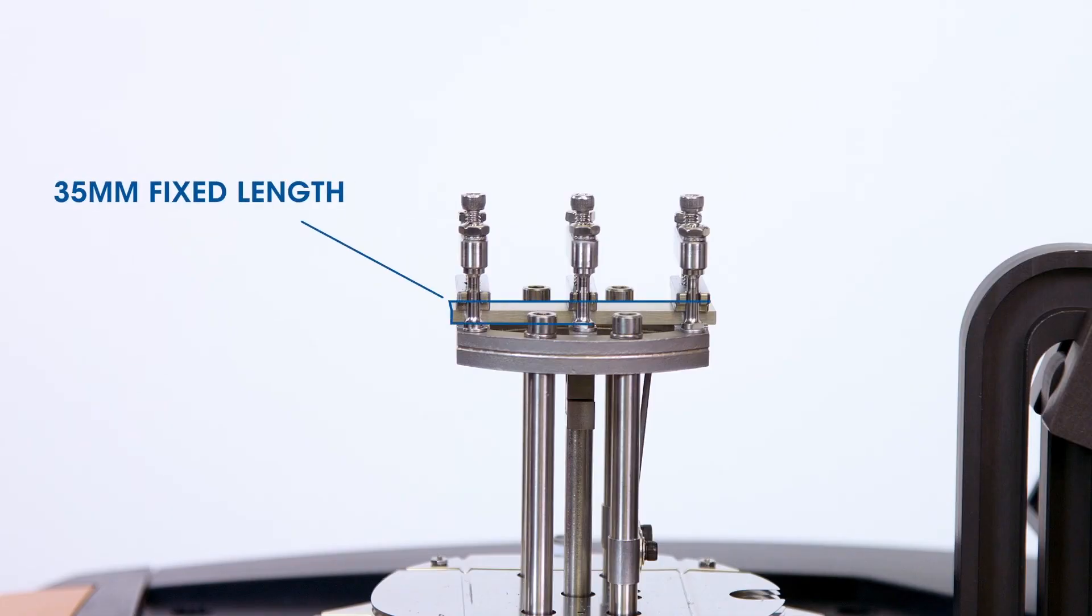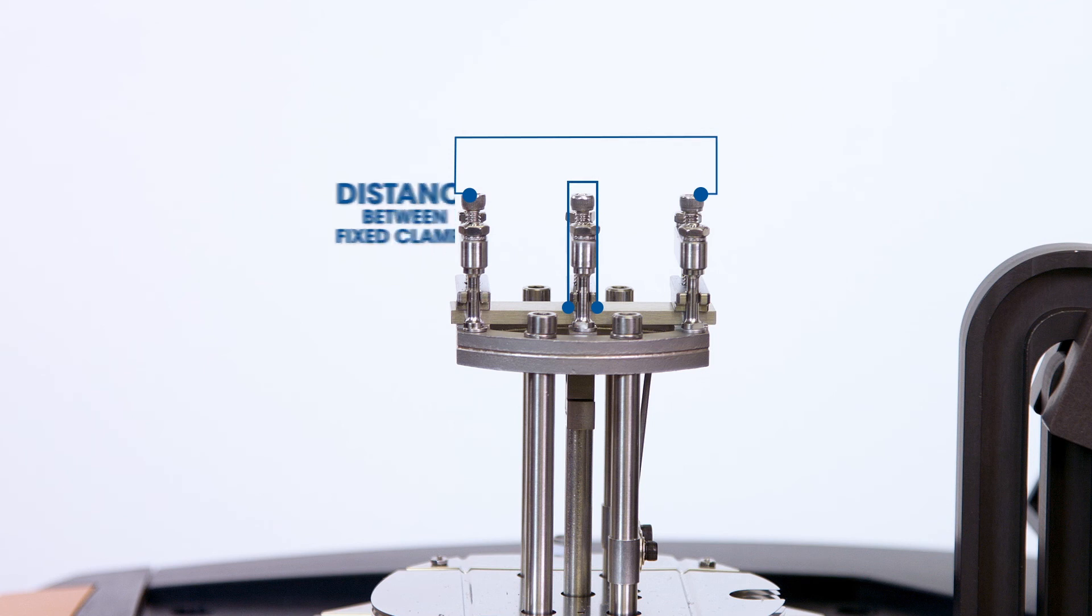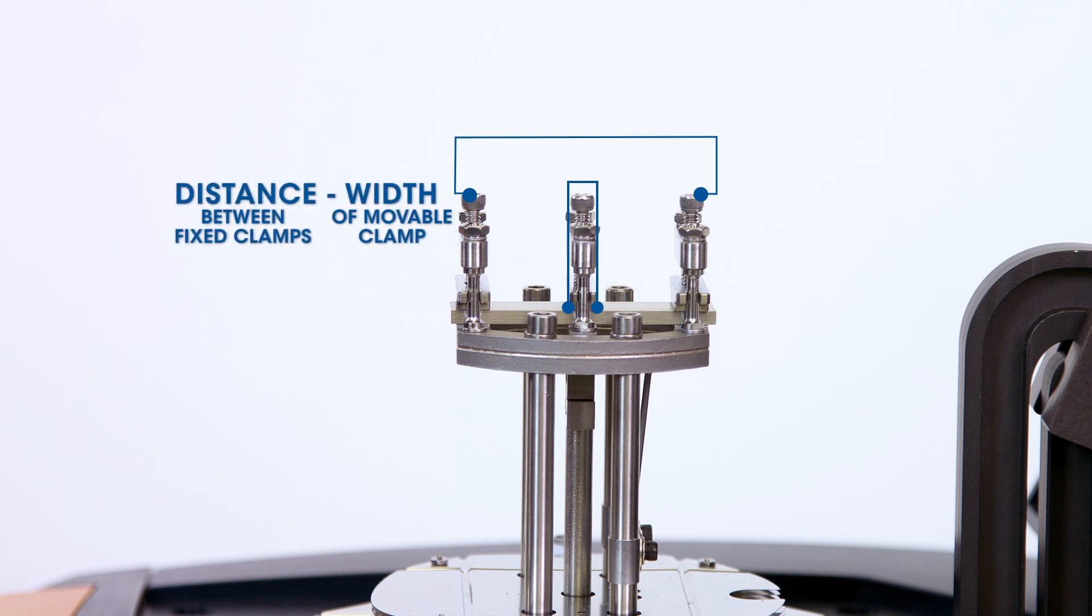Please note that when using this particular clamp, the length of the sample is fixed at 35 millimeter. It is the distance between the fixed clamp subtract the width of the movable clamp. You can always use smaller size dual cantilever clamps for shorter samples.